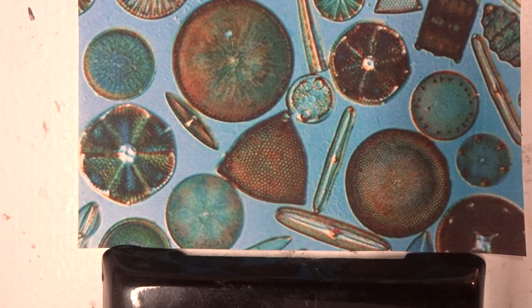500 micrometers is only half a millimeter long, or about the width of a human hair. So a large diatom is only half of a millimeter. Yet they possess beautiful patterns in their silica shell. Diatoms live in oceans, lakes, ponds, and even wet soils. Diatom shapes allow them to either float or attach to a substrate to live.